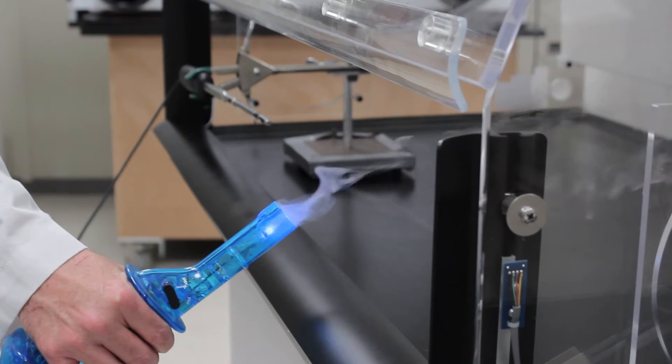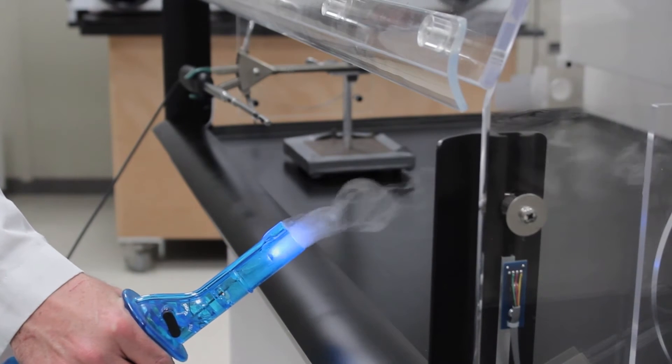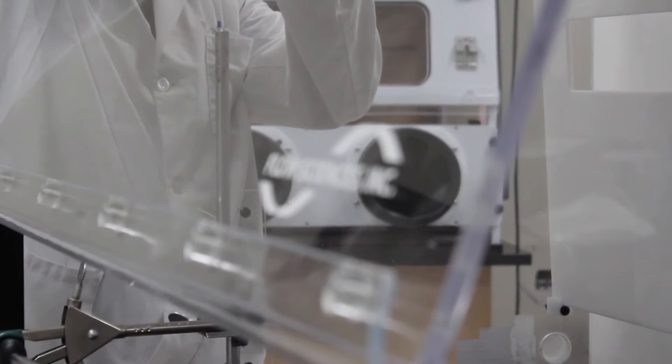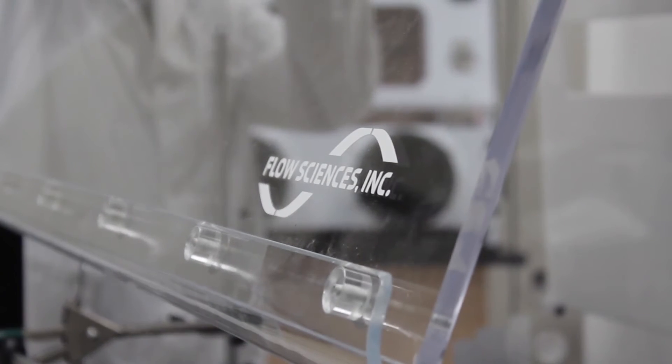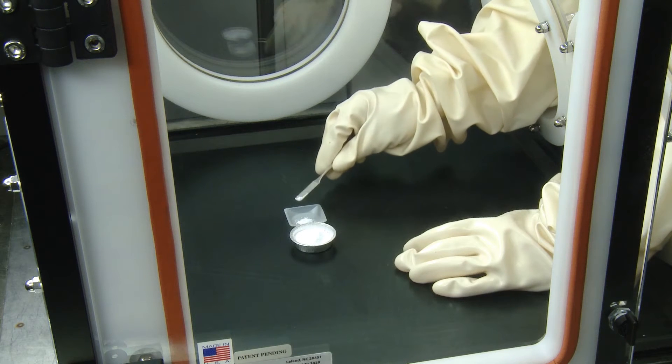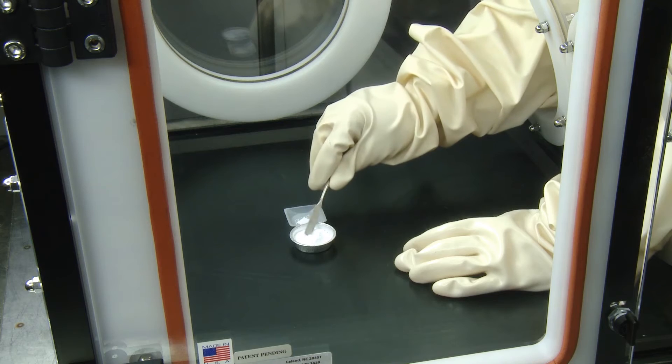Take the controlled atmosphere contained environment glove box. Many of the components used in this unit are common across the line. The transparent acrylic construction, here used for most of the box but used only on the face of others, provides operators with a clear view of the interior.